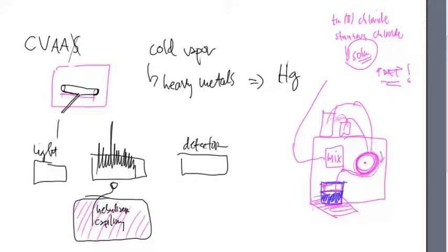So the mercury actually gets presented into this tube from this front piece, and that delivers the mercury into this glass tube, and this glass tube will keep my mercury in a location so that I can read it after a certain point. These tubes are somewhat open at the end, and that opening allows the mercury to be exhausted and sucked up and out of the machine eventually. You don't want a buildup of the mercury on the inside because that defeats the purpose. You can't have that happen.